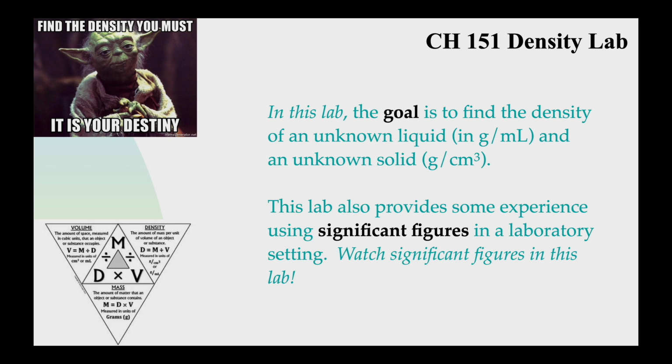It's pretty chill. In addition to learning about density on this lab, this is also a significant figures lab. So make sure you watch your significant figures rules when you're doing calculations. There's both multiplying and dividing, i.e. the actual density calculation part, but there's also some addition and subtraction when you're taking the mass of the flask filled with the metal and water minus the flask with just the water, that kind of stuff. So watch out for those kinds of things.